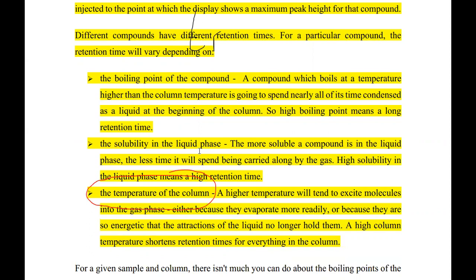Two, the solubility. How is the sample dissolving in the stationary phase? The other one is the boiling point. Of course, these points we have already exhausted them. It depends on the temperature of the column, depends on the stability. The temperature and the boiling point are one and the same thing, though we can split them: the temperature within the machine determines how the sample must evaporate, or the boiling point of the sample. These are some of the things that would delay even the results.